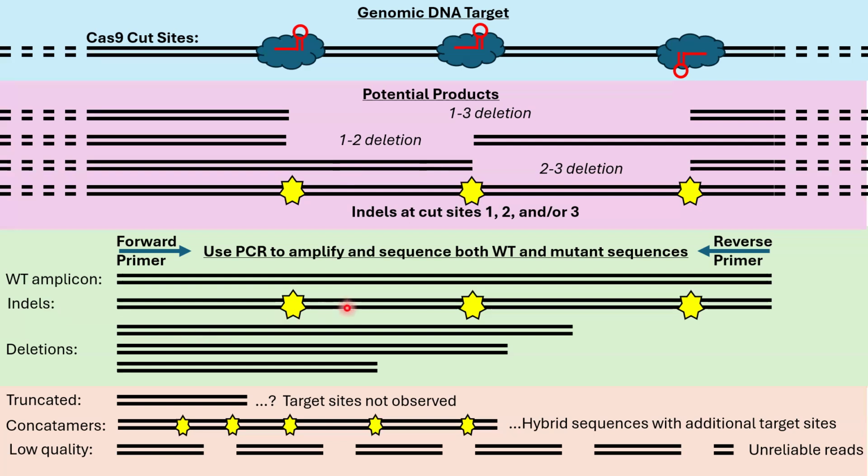So with that in mind, we can run this PCR and we're going to get somewhat of a distribution here. We're going to get some of these amplicons that are pretty short compared to the wild type because of those large deletions. And we're going to take that mixture of amplicons and submit it for nanopore sequencing.